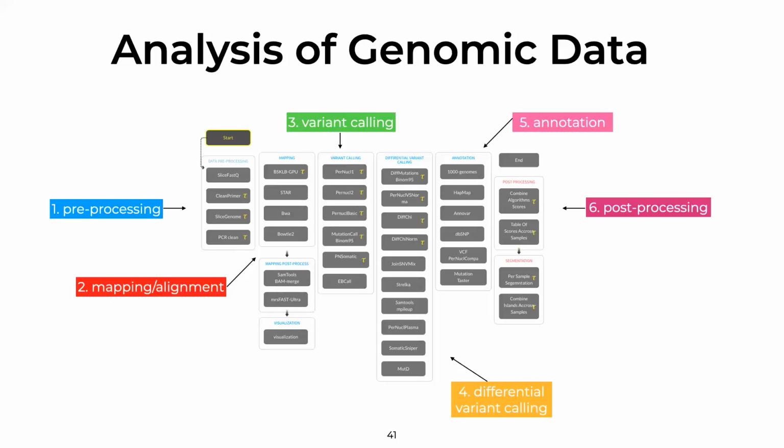Now, there's also a step that we can apply that's called post-processing, and post-processing helps us evaluate the different types of information that we have through the processing steps to understand whether there's an enrichment in mutations, for example, for a particular segment of the genome, or if there's an accumulation of mutations in closely related positions. That relationship could be identified statistically as being a part of a consistent region or regions that might be interrelated or similar.